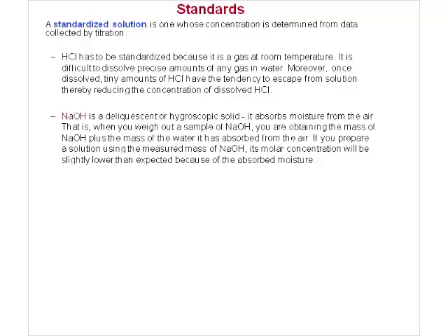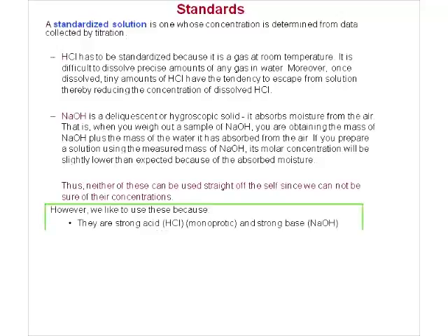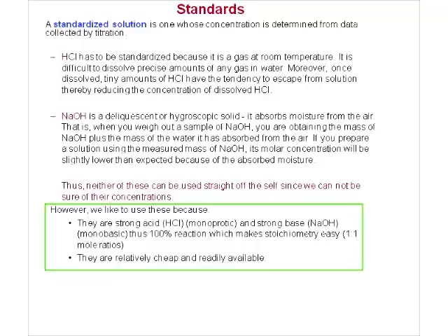We have issues with these guys. They cannot be used straight off the shelf because we're not sure of their concentrations. All right? Now the question is then, why do we like to use it?